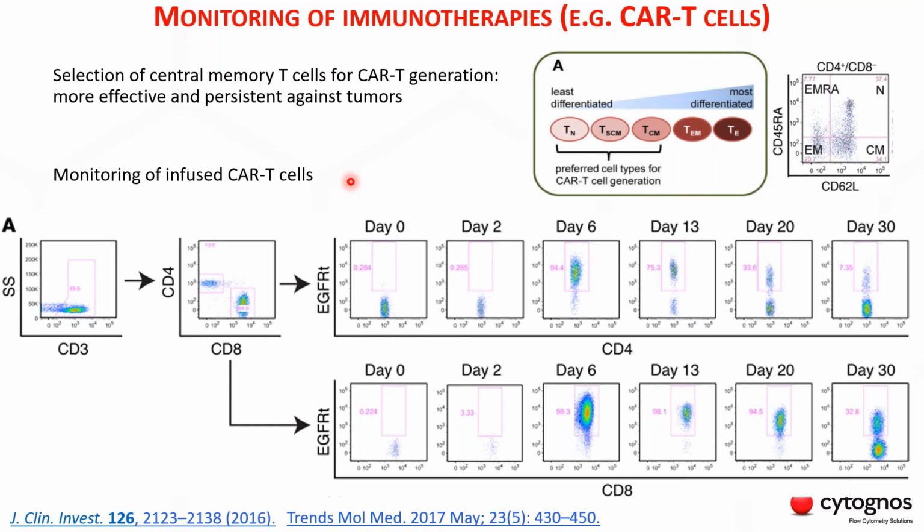In the lower part of this slide, we can see an example of monitoring the infused CAR T-cells over time. So you can perfectly follow up when the treatment is more effective, and also what is happening days after the treatment. And we can see if we still have effective CAR T-cells or what is happening in this patient with the CAR T-cells previously infused.